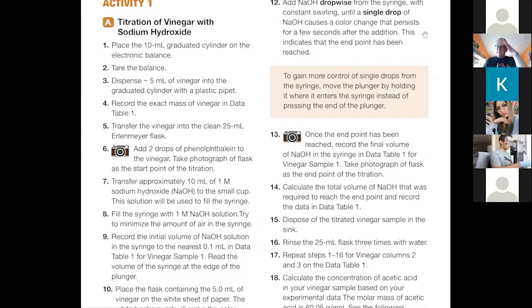All right, so how's everyone doing? Did they get at least 2 done already? Yeah, I did. I keep doing it, it's clear, and then I add one more drop and it turns red. Yeah, that's what's going to happen. You saw from the titration curve that at the inflection point, the pH changes radically. It goes from a pH of around 4 or 5 to a pH of 10. So it changes 5 pH units in less than a drop.